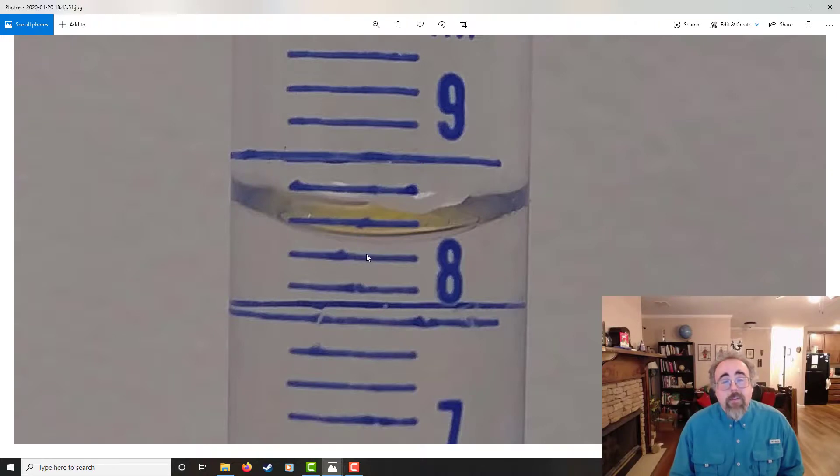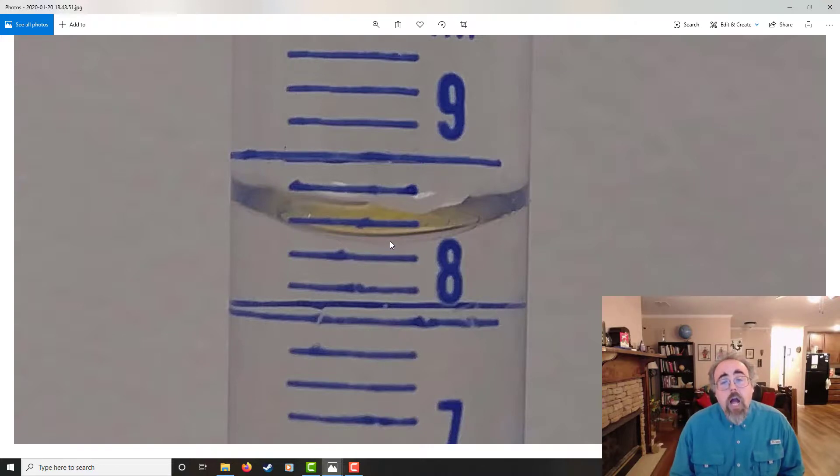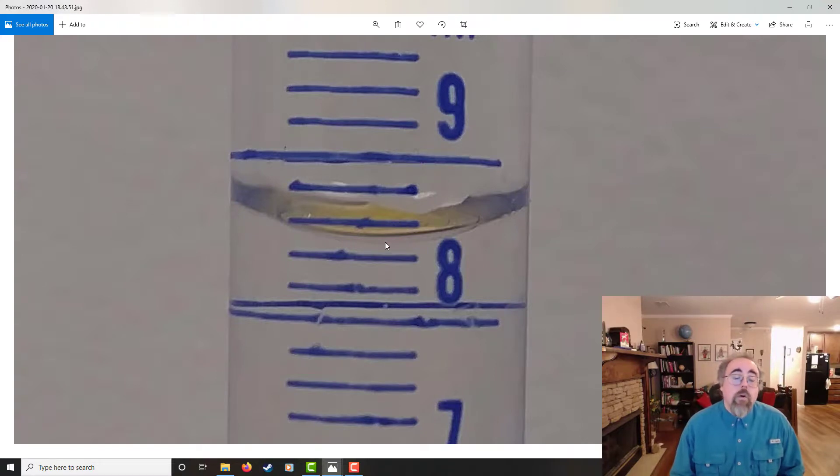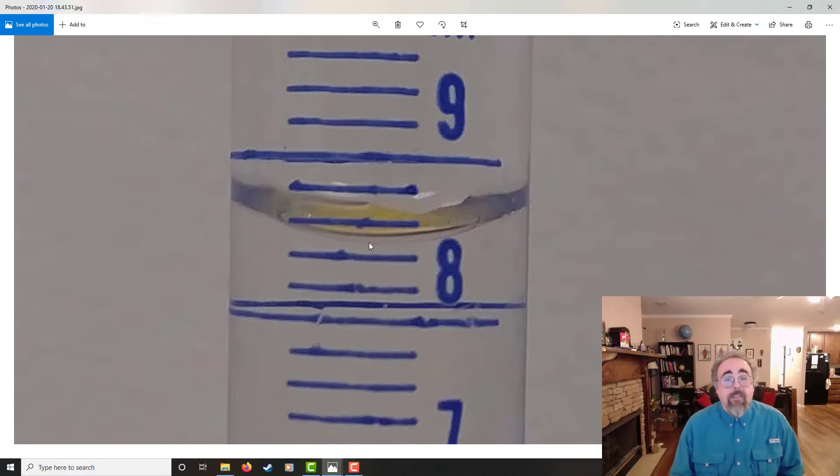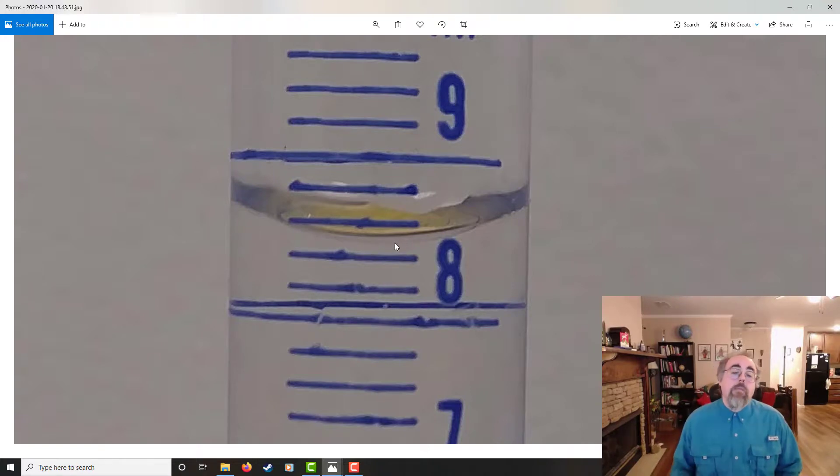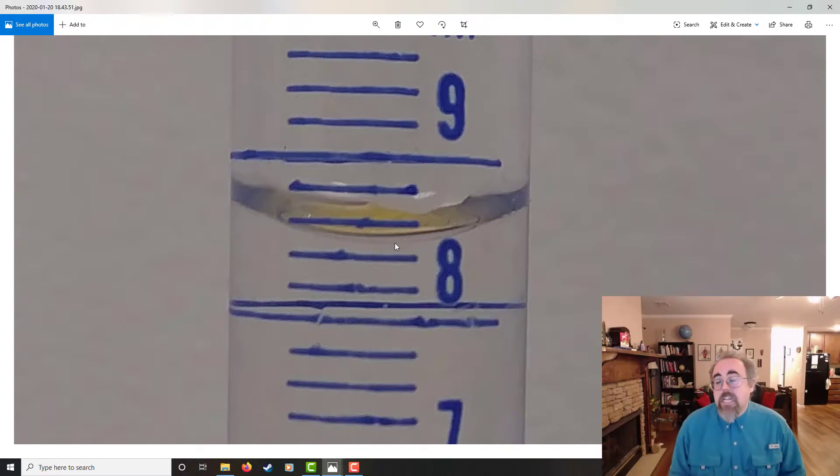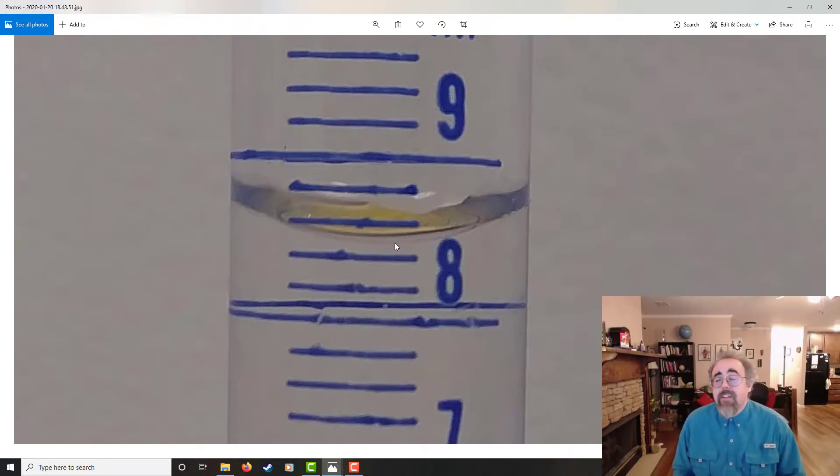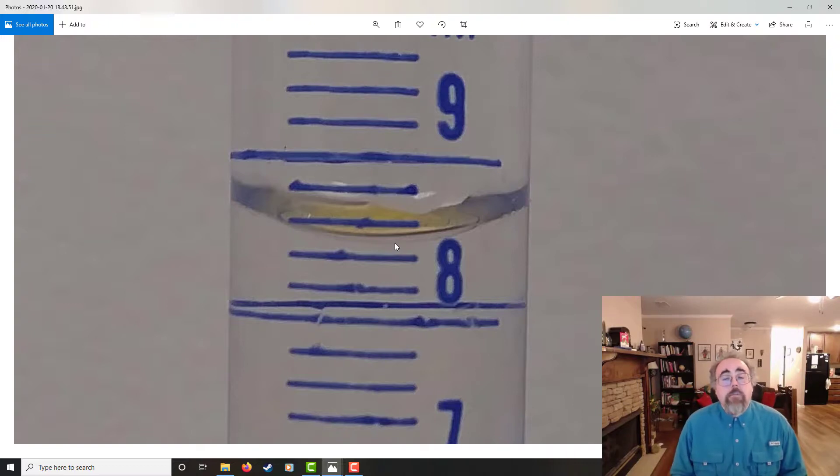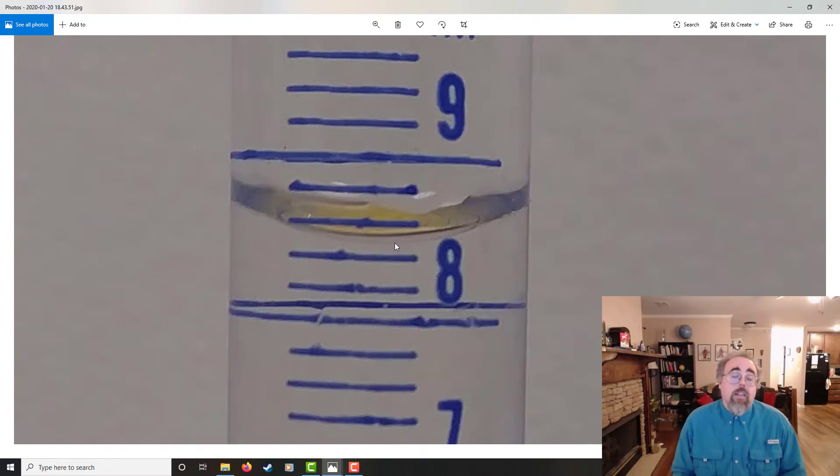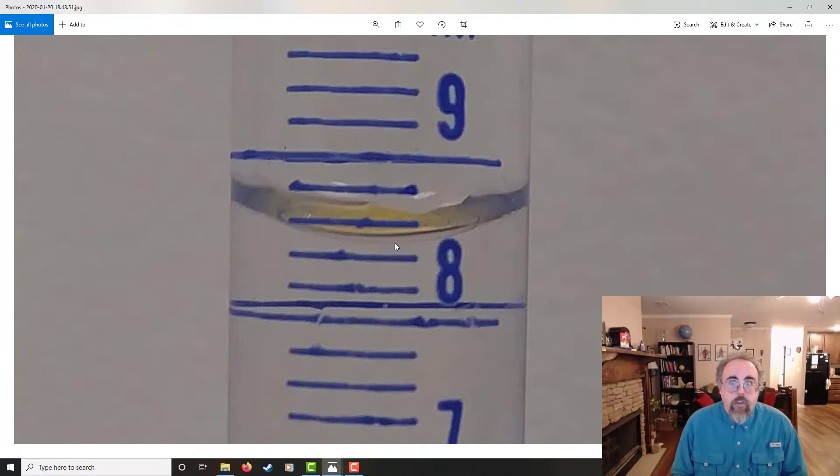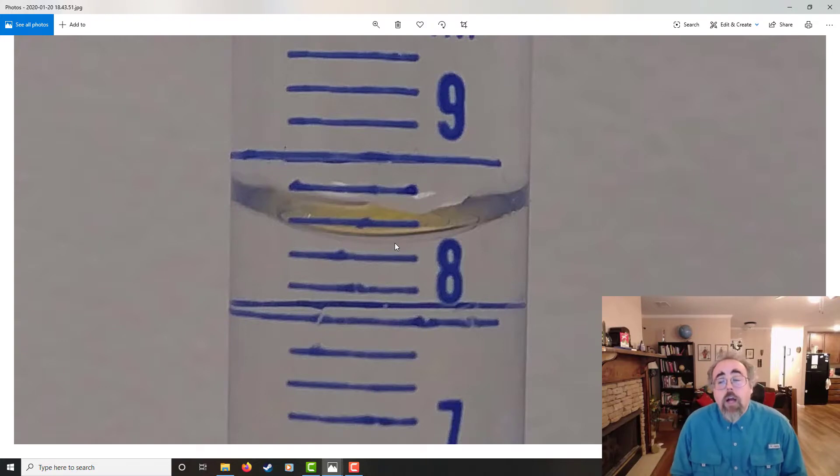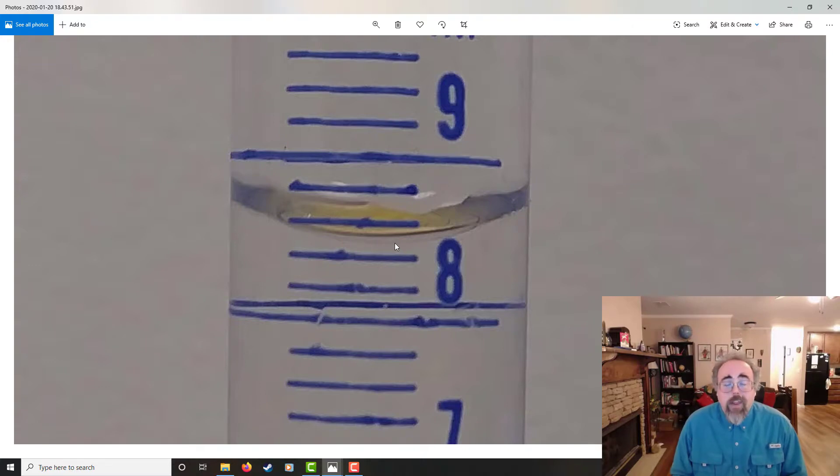With these guys, it gets a little bit like, I think I can get three significant figures, but it's a little bit trickier. So this one is, if these were ones, I'd probably put that at the halfway or the 0.4, but obviously they're not. So halfway would be at 8.5, because that's 8.4, that's 8.6. So definitely an 8.5. I could probably argue do an 8.48 or something. That estimated digit is now definitely a little bit wonkier than we normally would like, but it's still legit. So I think I can still get three sig figs, but I would not be relying on that last significant figure. Significant figures are actually not the perfect way to describe accuracy and precision. Well, precision, I should say. There are other approaches. They're just kind of a nice, straightforward approach that doesn't involve any advanced algebra or calculus.